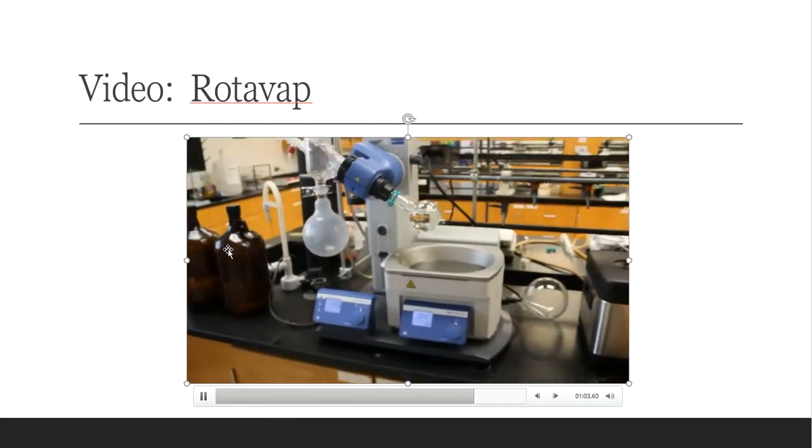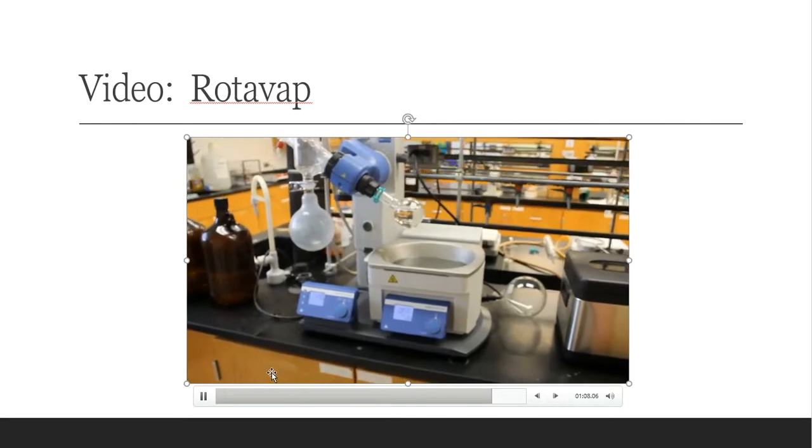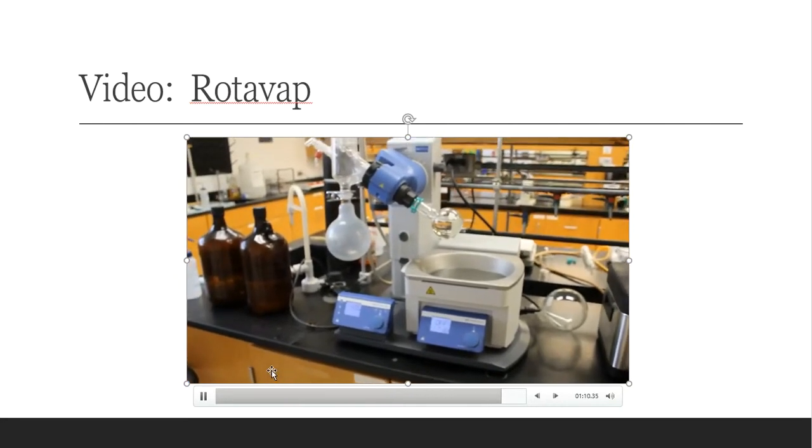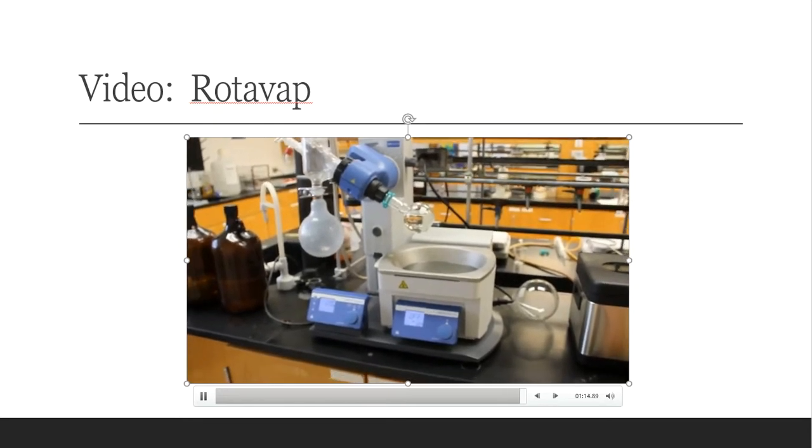The nice thing about it though, very much automated, which makes me very happy. So I'm getting ready to put my peanut oil into the system, and we're going to evaporate off the solvent and collect the peanut oil at the end.